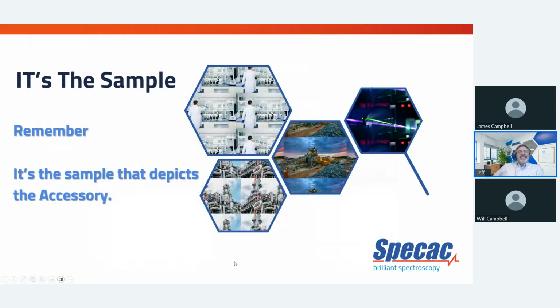So the biggest thing I want you to remember is that it's the sample that dictates the accessory. Just because you have an ATR or a transmission accessory or another one of the accessories there doesn't mean you're going to get the data that you want. It's the sample that picks the accessory to get the data that you need.